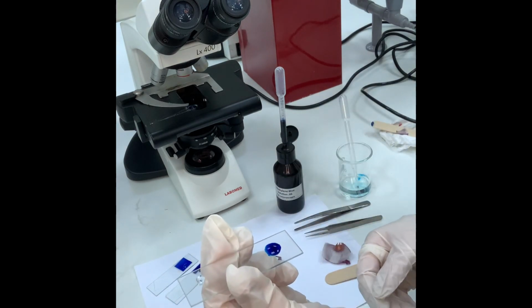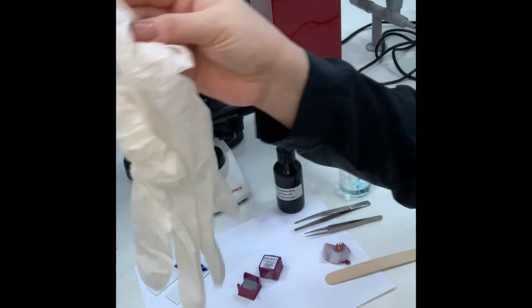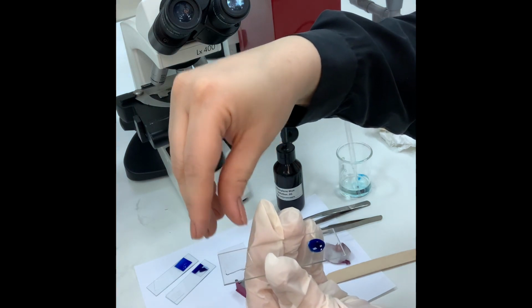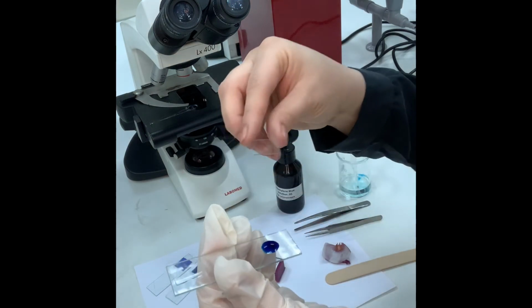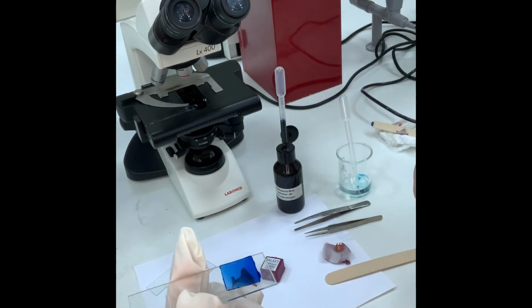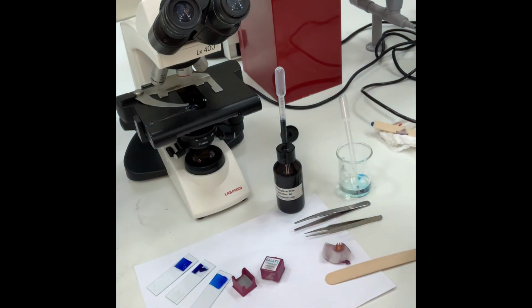and I will add my cover slip, but this is large. Oops, it's very large. You need to wear your size, but this is the one I can find right now. I'm careful, of course, because this is real fungus that I'm using. See, that's it. This is a fungus sample ready to view under the microscope.